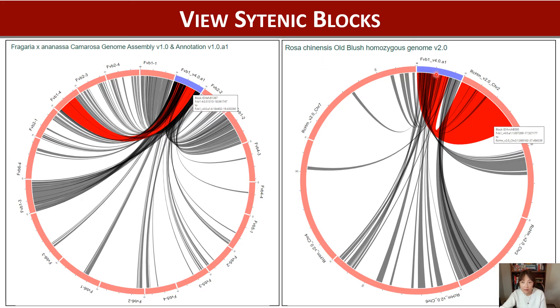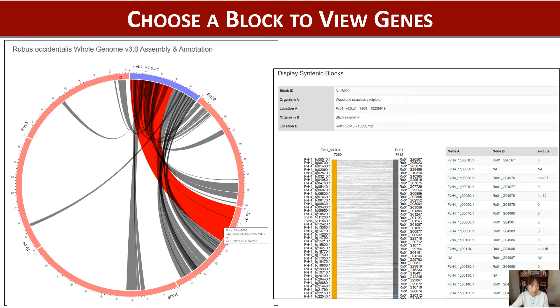This shows synteny blocks between Fragaria vesca chromosome 1 and Rosa chinensis, and you see a major synteny between the two chromosomes. And this shows synteny between Fragaria vesca and Rubus occidentalis, and again you see a major synteny block between the chromosomes.